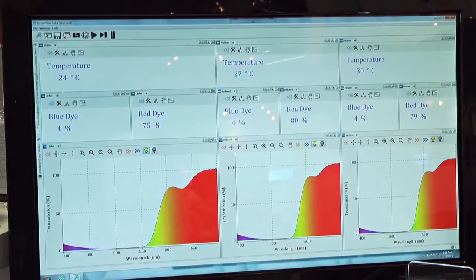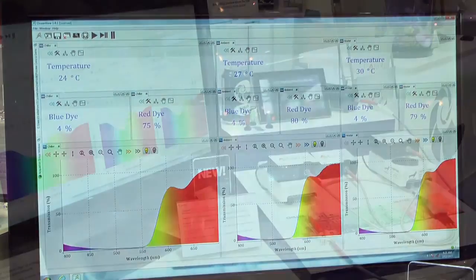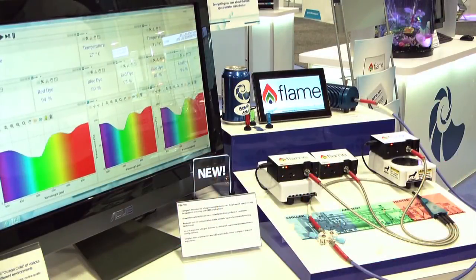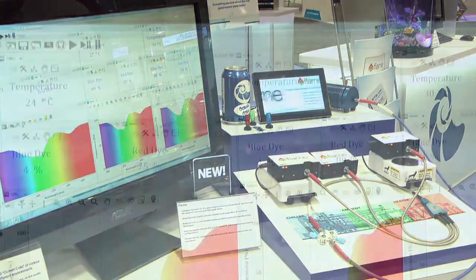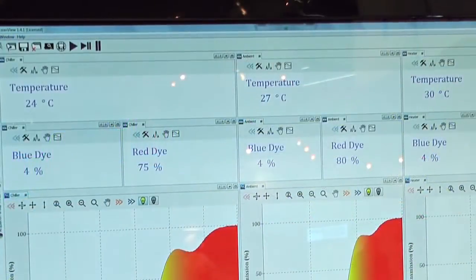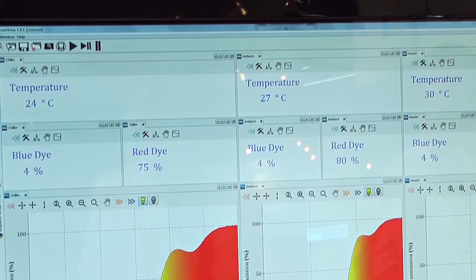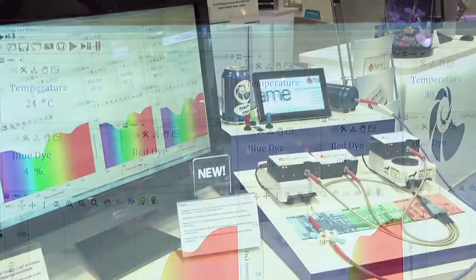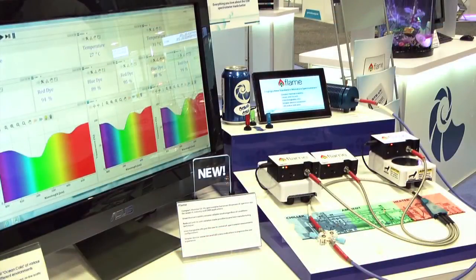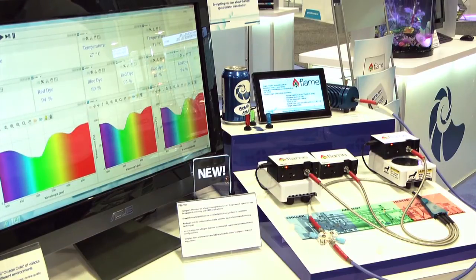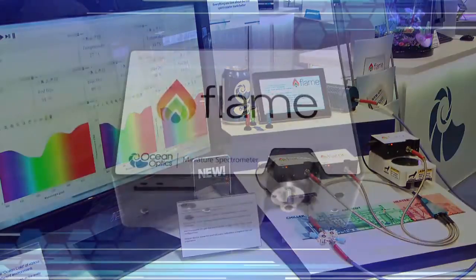In this process, what we see is different dyes and different colors going through an absorbent setup. We're operating at three different temperatures — from slightly cooled at 24 degrees, to ambient at 27 degrees, to slightly heated at 31 degrees — and we see that the concentrations of the dyes in this absorbent setup are the same across all those instruments.